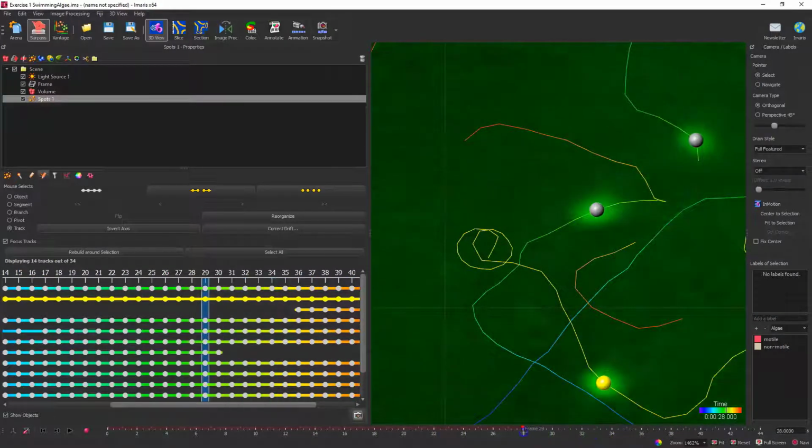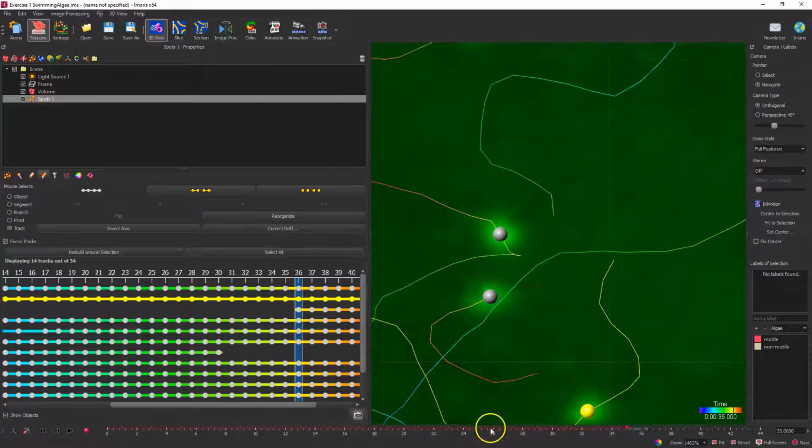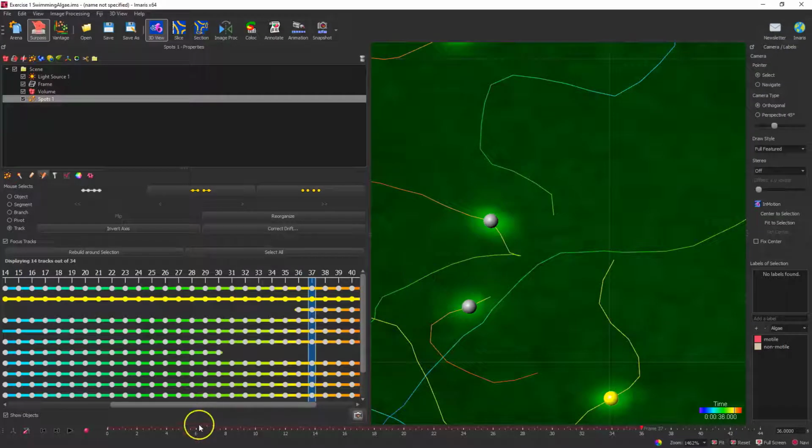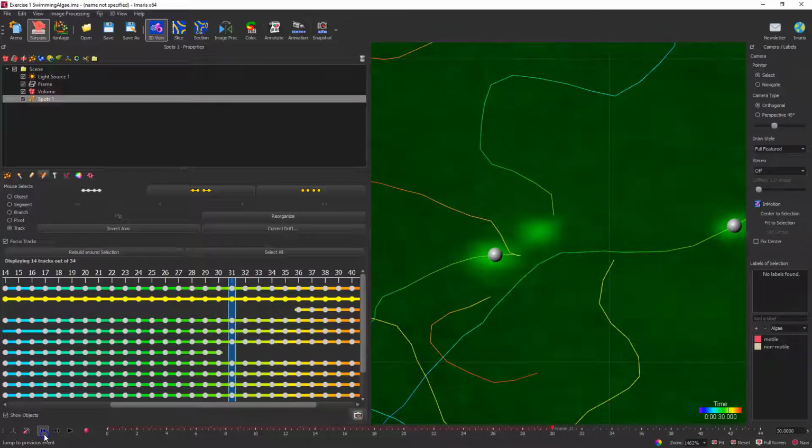Looks like I still got one little issue here, and it takes place a little bit towards the end. So here, I got one that comes down, and you know what? I'm going to guess this is a billiard ball moment, all right? So I'm going to guess that this one coming from the top actually bounces off and goes up in the upward direction. Again, you know, if you had a little bit better imaging, a little bit better resolution, you'd be able to resolve that.